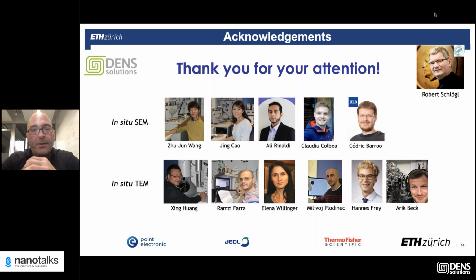But I was leading a microscopy group for catalysis for many years. We looked at thousands of catalysts, before and after, and some seem not to change much, but they have some secrets of operation that I don't know yet. You need to study catalysts under relevant conditions, and not enough people are doing that yet. It would have a bigger impact if we spoke more with the companies, but too few people are doing that, I think.